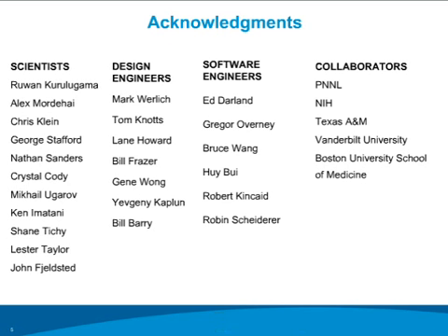I've really enjoyed our close working relationship with Aaron and Dick Smith at the laboratory, and as you know, they have pioneered the development of ion funnel technology, in particular when it's been coupled to mobility to show very nice improvements in sensitivity and performance that we'll be talking about today. Also, we've been working with Al Yergi at NIH, and he's helping us to understand the added utility of collisional cross-section measurements to his research.